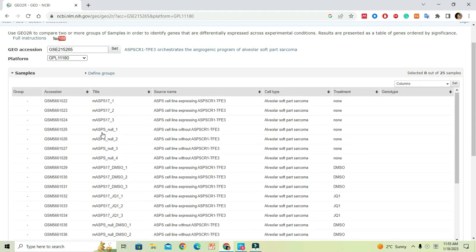When the study is large, this data contains a large number of samples. From this list, we have to choose what samples we are going to compare in the analysis. In this window, by observing, we have to identify what groups we are going to take into our analysis.